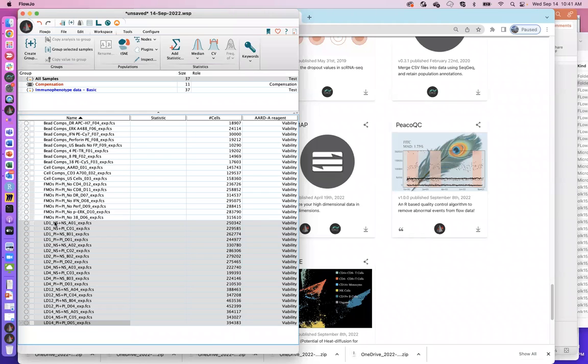And each of these patients have a time course associated with them, but you cannot understand that time course from the file name itself. You just see NS and SPI, blah, blah, blah. So really what has happened here is there's a 0, a 20-minute, 1 hour, and a 2-hour time point.